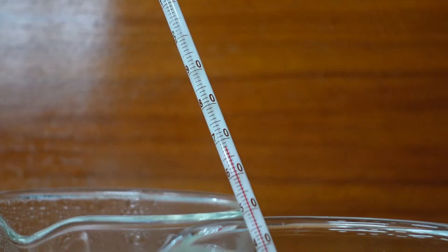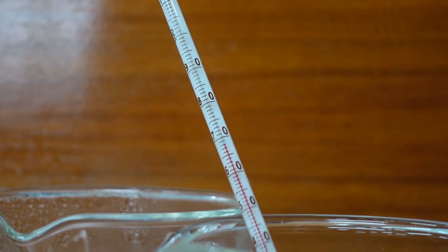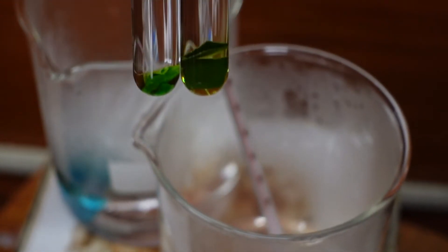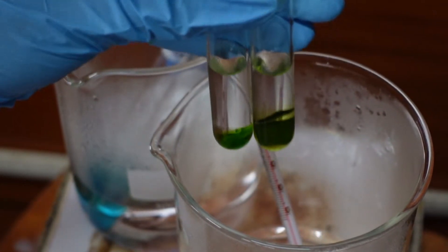Then place these test tubes in a hot water bath about 70 degrees Celsius until the leaves appear bleached.